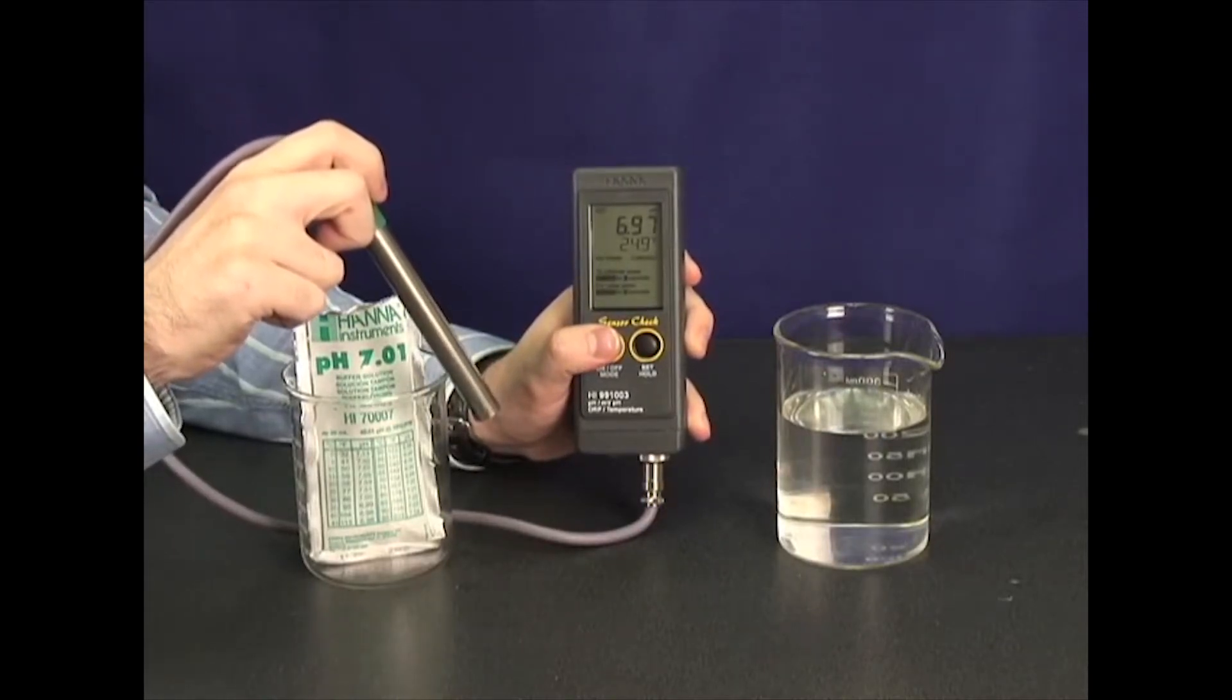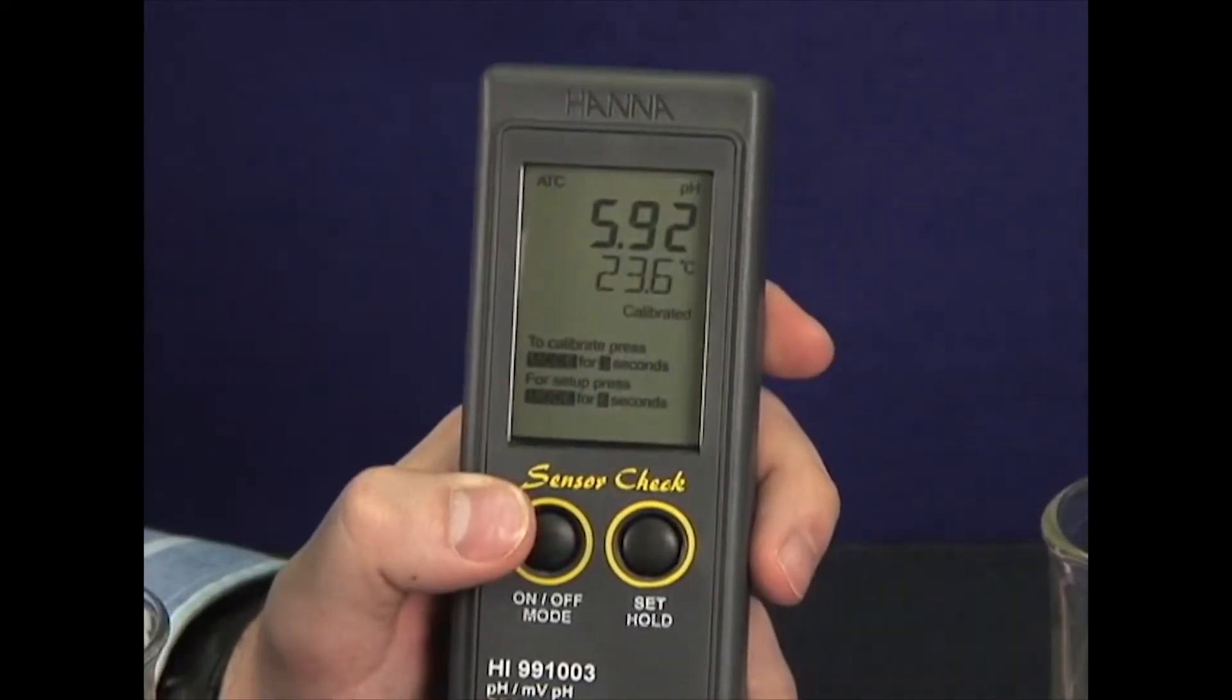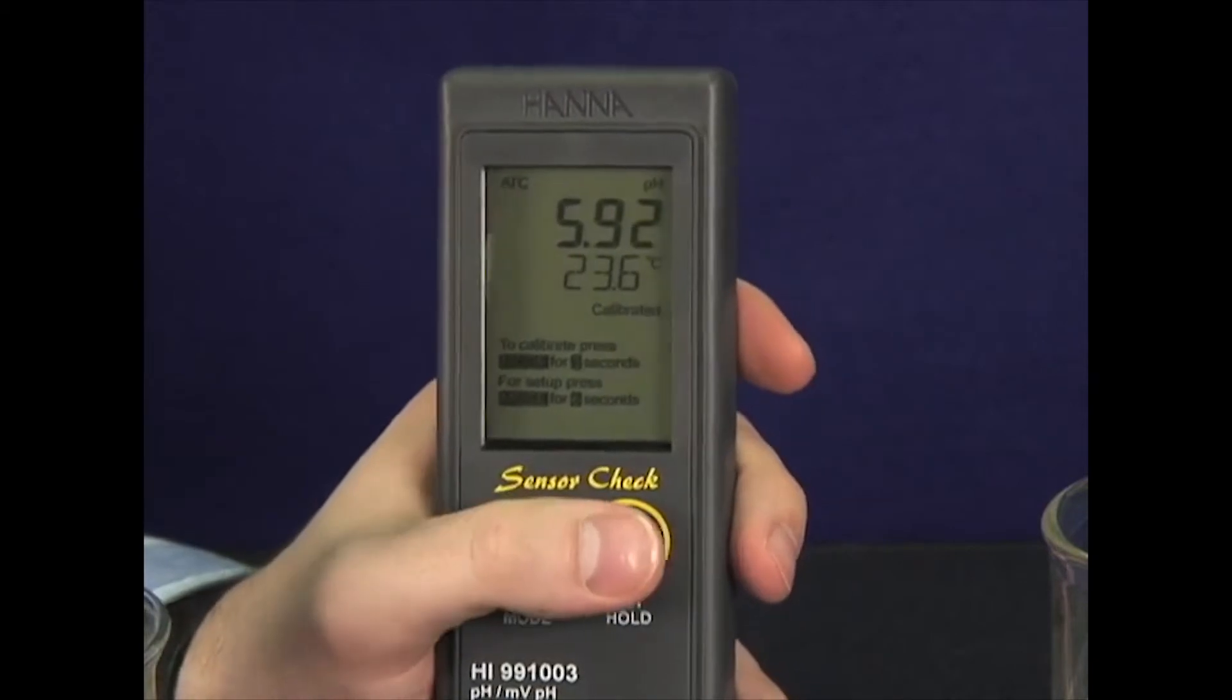Now that your meter is calibrated, just dip the electrode in the sample and you're done. The meter will give you a pH, millivolt, ORP, and temperature reading instantly.